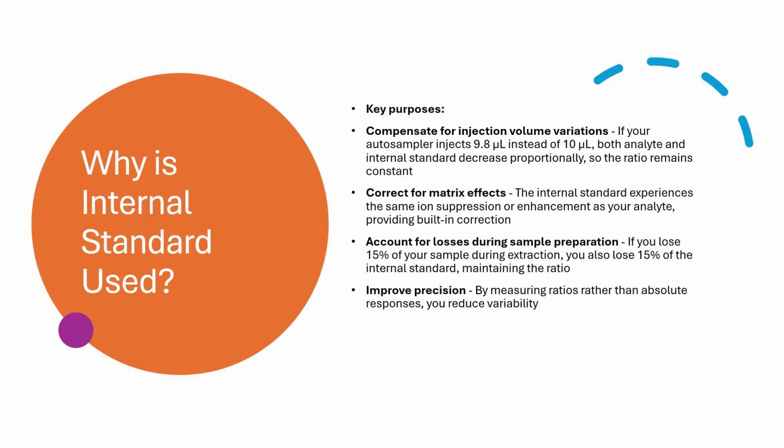So here comes another interesting question. Why is internal standard used? Now, internal standards are compounds that are added to every sample and calibration standard at a known concentration. The purpose of adding this IS to your sample or to the calibration standard is that it compensates for injection volume variations.